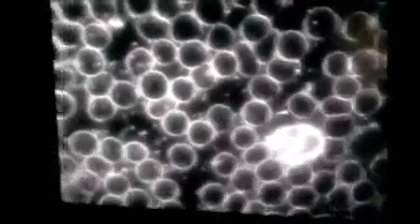Here you see the blood 30 minutes after taking the rain product. As you can see, the red blood cells, which are the round bubbles, are free and clear of each other. They're touching but they're not sticky and overlapping. In the center we see another white blood cell and it's in good form.